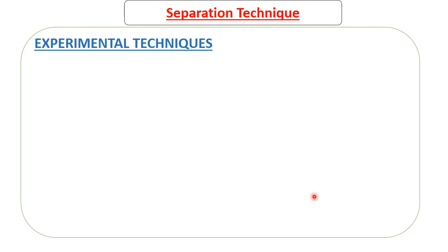We're going to look at instruments that are used to measure volumes because there are different types of instruments which are used depending on the situation. So we're going to see in what type of situation each instrument is used. And after we do that, we're going to take a look at how gases are collected after experiments. When you are doing experiments, when you mix one or more things, they are going to react, and at times, depending on the type of reaction, you can end up having a gas. So how do you collect that gas? We're going to take a look at 3 different ways of collecting a gas.